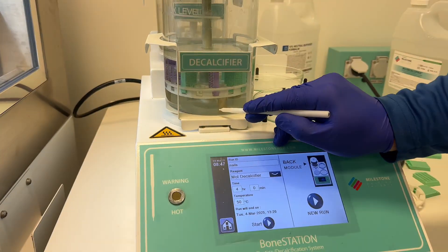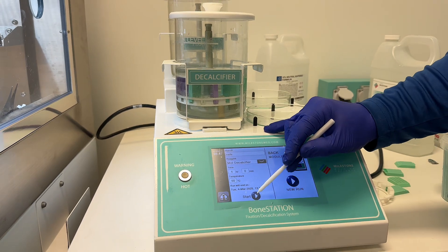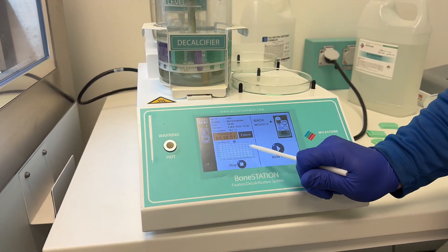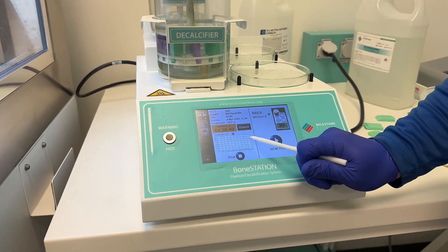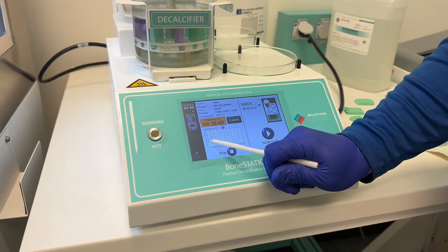The heated plate underneath helped speed things up. This run took about five hours. When softening bone, the time needed can vary depending on the density of the sample — some specimens can take days or even weeks at room temperature. Adding heat and using a system like the bone station speeds up the process significantly.